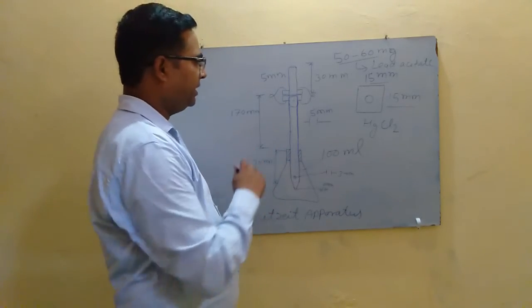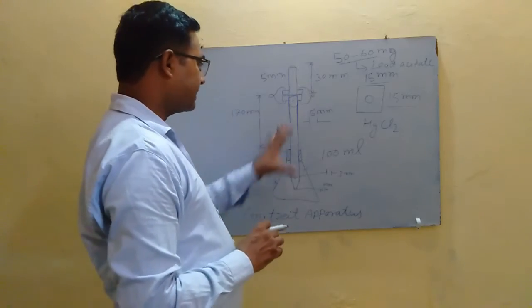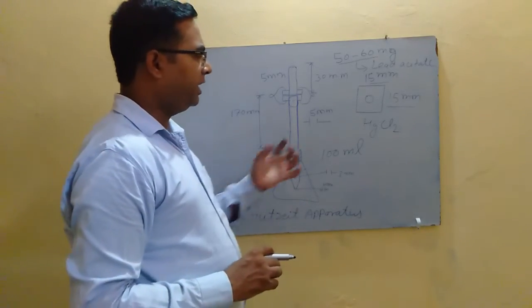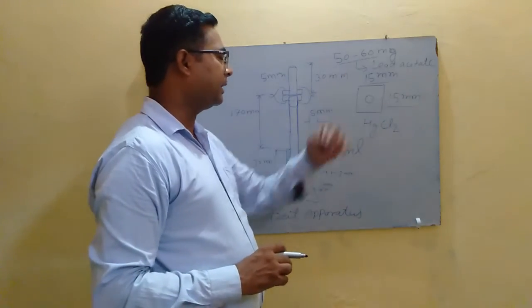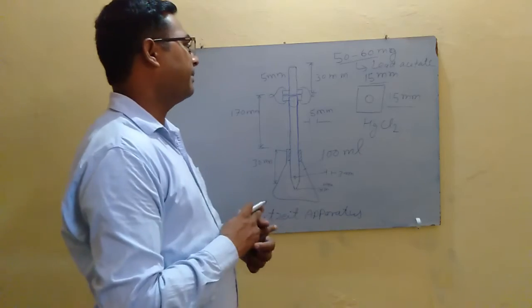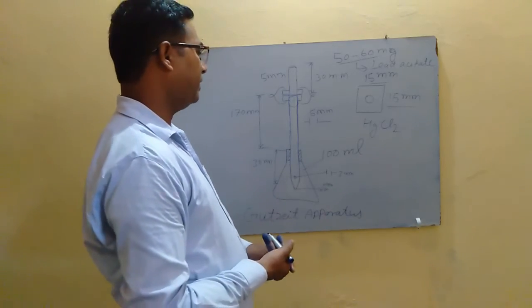Otherwise, if the stain in the test apparatus is less intense than the stain in the standard apparatus, then our sample passes the limit test of arsenic.